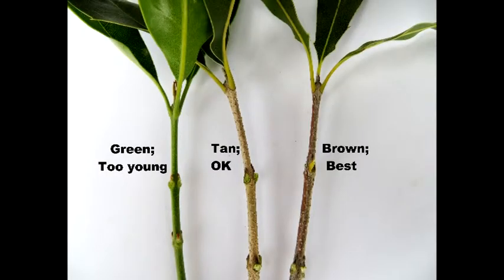Sampling macadamia nut leaves is fairly simple. However, there are factors that can throw off your results if you are not careful. It is important to choose the proper branch to sample. The branch on the left is green and too young for sampling. The tan branch in the middle is okay, but the darker brown mature branch is in a resting state and would be the best option.